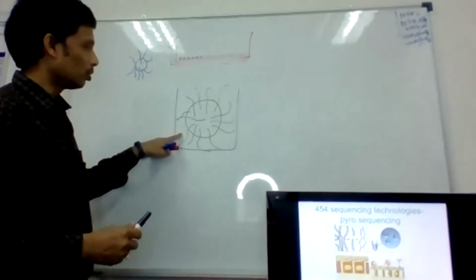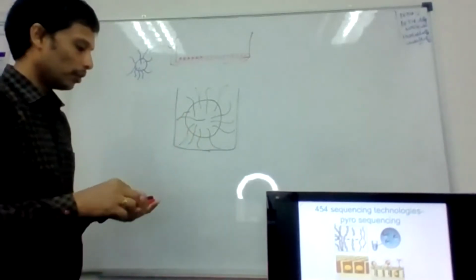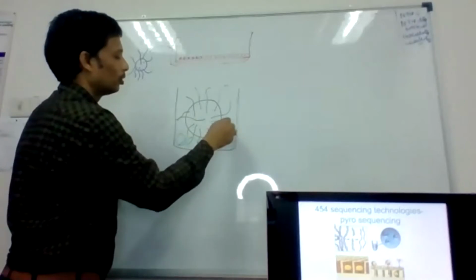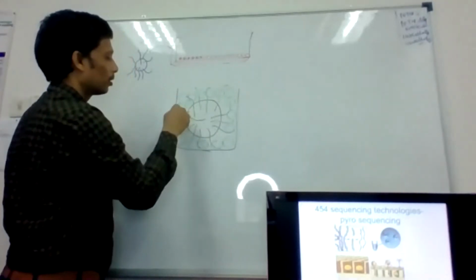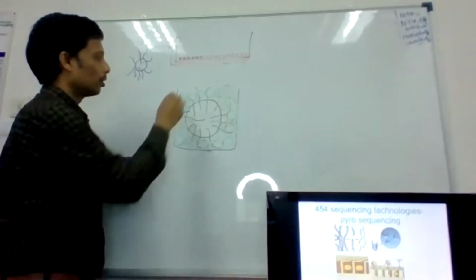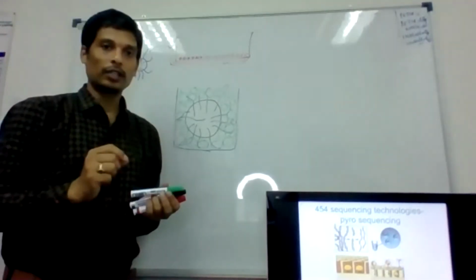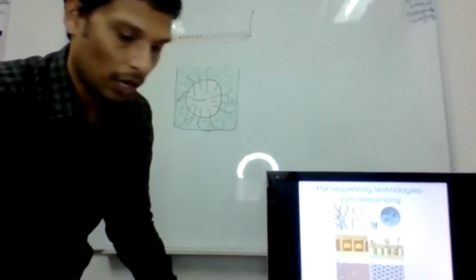After introducing this, we are going to add a few more small beads. I'll tell you what those beads are later. Then, apart from that, in the third step, this is how it looks.